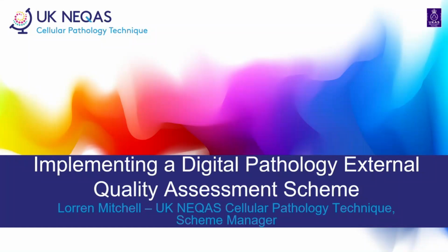Hi guys. So yeah, for those of you who don't know who we are, we're UK NEQAS Cellular Pathology Technique. We're an external quality assessment scheme and we provide quality assurance for all aspects of cellular pathology. So not just digital pathology, but all areas of how you create a slide.